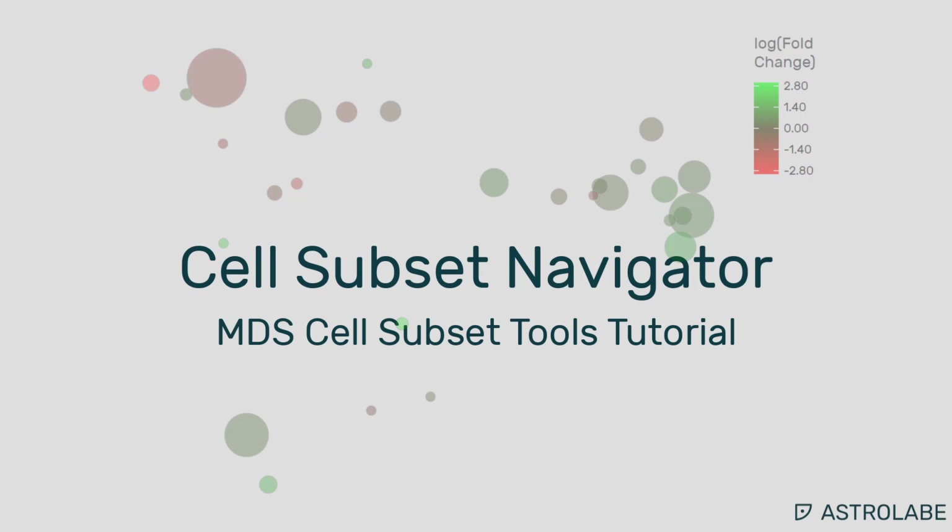And welcome back to this tutorial for Astrolabe's Cell Subset Navigator. In this video, I'm going to show how to explore cell subsets using the MDS Map visualization.